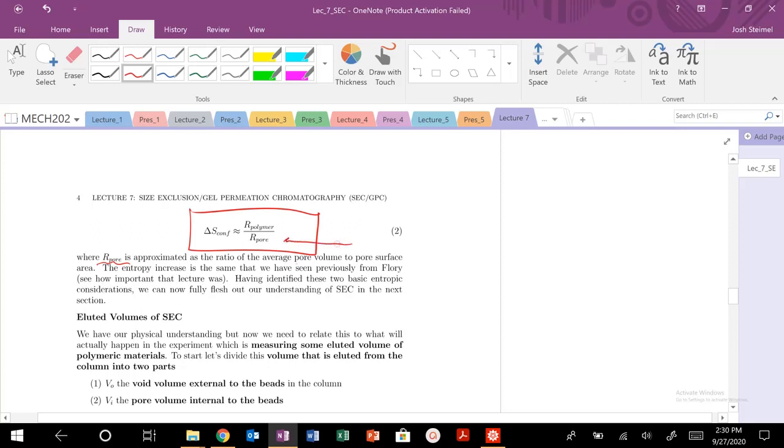It's really hard to measure the radius of a pore, so usually it is deduced from the ratio of the volume of my pore to the surface area of my pore, which is going to be some characteristic length. You've probably seen this, similar to the Biot number. But anyways, it's going to give you some volume or radius.